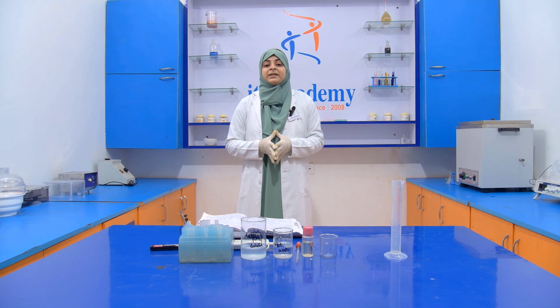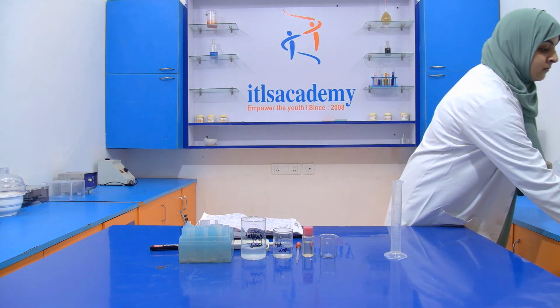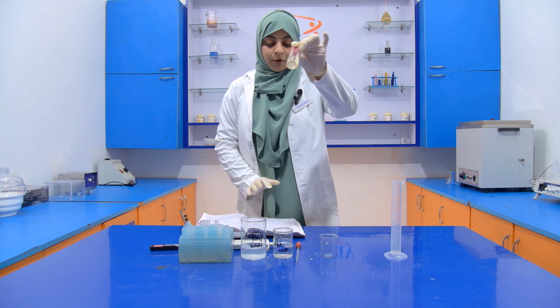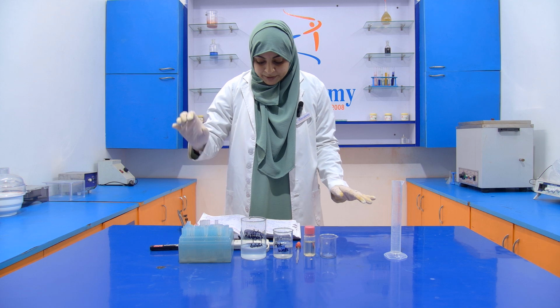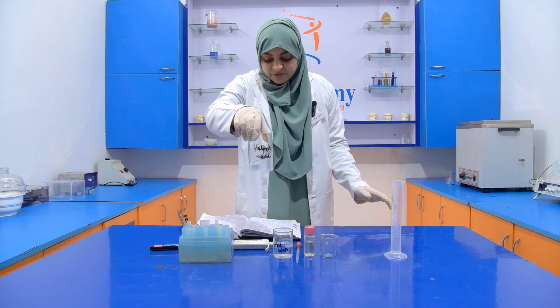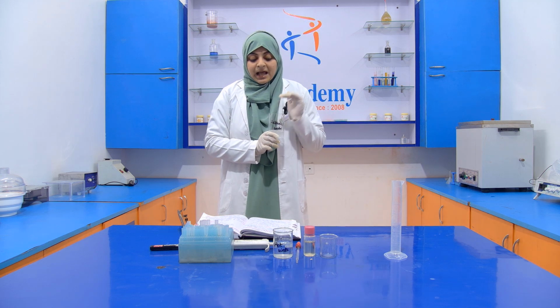So for performing this experiment, we require this setup. Okay, so we require what? Oil as a sample, and we require hot water, and we also require a chemical that is called Halphen solution. Okay, now how do we prepare this Halphen solution?